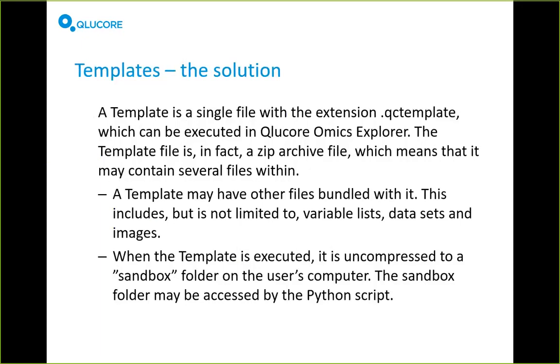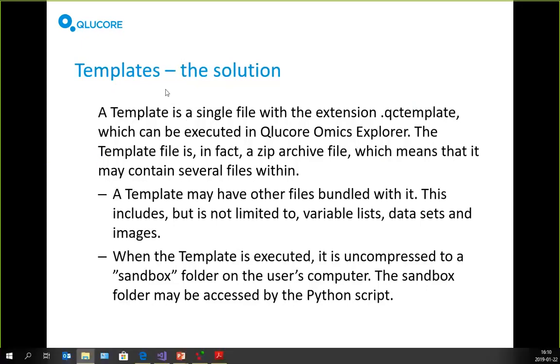The template contains executable code that tells Omics Explorer to do something, along with a configuration file and possibly other things. A QC template file — which is our extension for templates — is in reality a zip archive. I can show you an example: here I've got several QC template files, and if I take one of them I can extract it with a zip archive extractor to see what's inside.